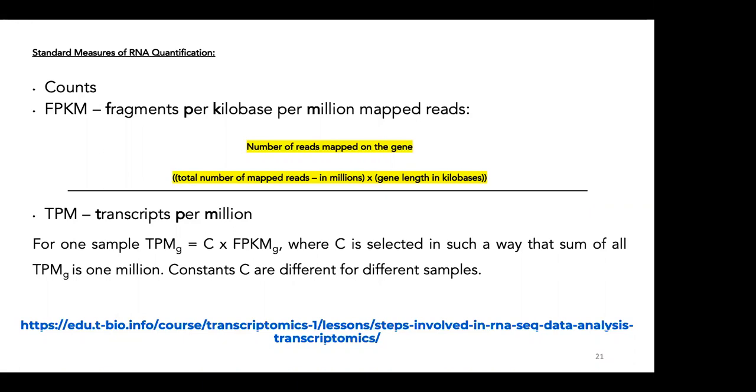So what we are trying to do here is basic mathematical normalization, which could help us in making the data make more sense in a biological aspect, or what is actually happening in that state where we took the transcriptome. So to do that, we do different types of mathematical normalization.